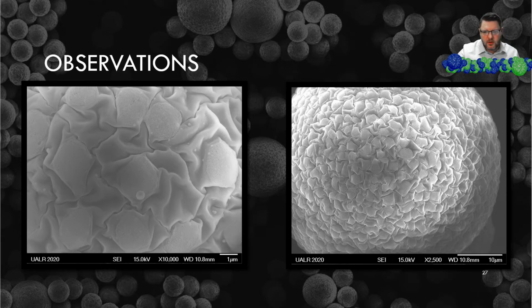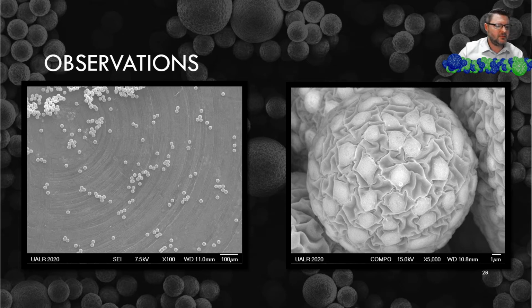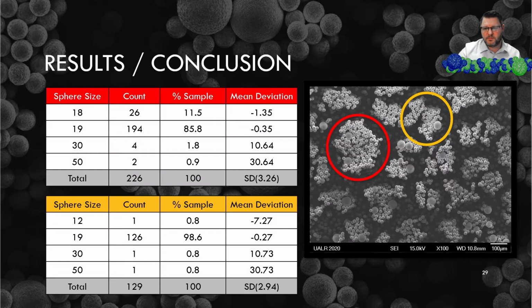Again, these two are both without XPS, so still really good images. But you can kind of see that porous or lattice structure right in here and over here. You can kind of see that, but it's just that detail's gone. So it's kind of tough. It's almost all the same kind of gray color there, but still really good images. 100 times zoom, 5,000 times zoom there.